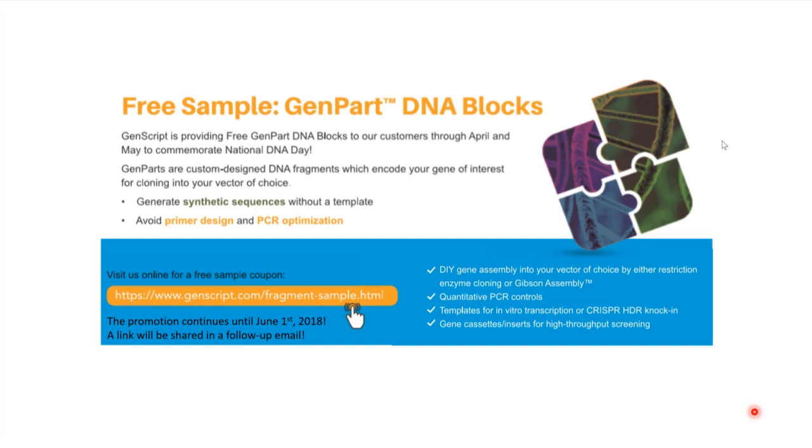And that's a great question, and it comes down to this: during a DNA assembly pipeline, you need to be very familiar with the type of failure modes that exist for the different types of cloning reactions. So if you're doing Golden Gate type cloning, which is still a cut and paste based assembly method, the main types of errors are compositional errors. So you'll be missing one of the fragments or having too many of one of the fragments. That's very different than if you're doing a Gibson or an isothermal assembly, where one of the most common error modes are point mutations at the new junctions formed. And so you need to know what type of errors are going to be prevalent with the type of reaction that you're running, because each of those will require different diagnostics.